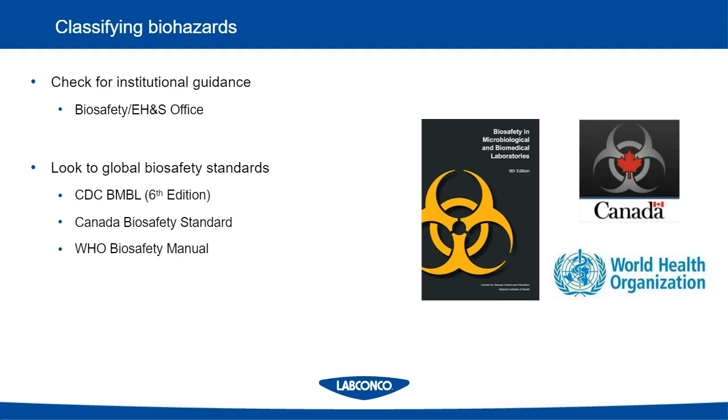This is really a complete guide to not only how you need to classify your biohazards, but what kind of steps and what kind of things you have to have in place in your laboratory to work with various hazards. This book will also outline what BSL level is required for your specific risk group of biohazard. Canada has a very similar standard, and the WHO has a general biosafety manual as well.